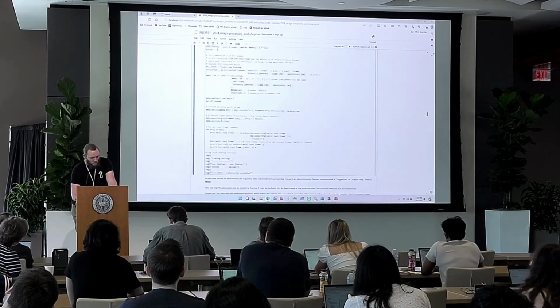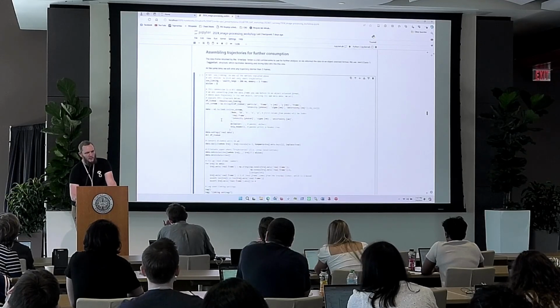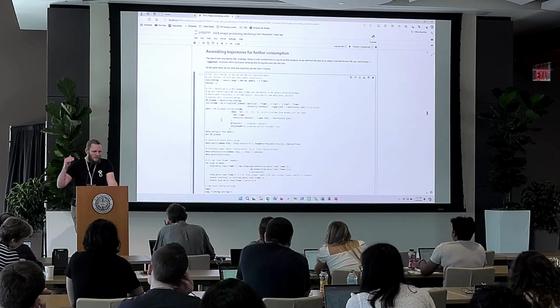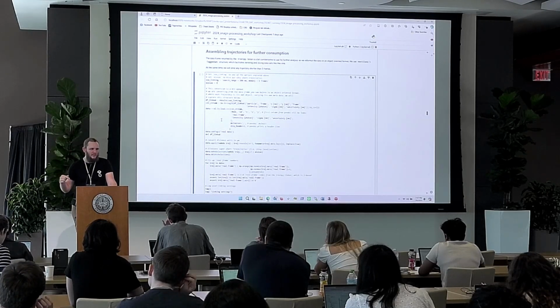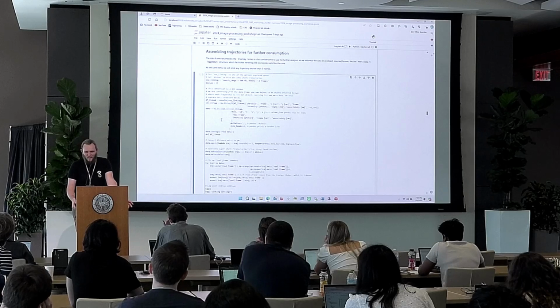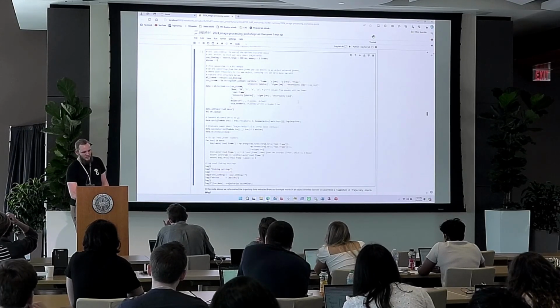The rest of what this code block does is it changes the structure of the data that we're working with. When you ran the linker, what the linker itself outputs is a data frame that just assigns an ID to each localization of which particle it belongs to. That contains all the information that we need, but it's not really how we think about a data set of trajectories, right? So that's what's happening in this block here.